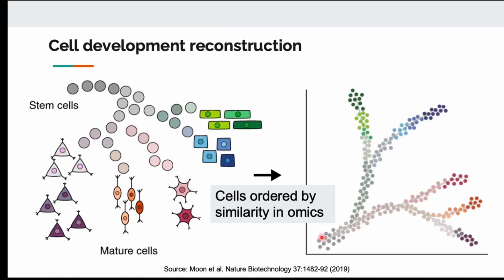So by isolating all the cells and collecting all the omics data, you are essentially seeing the transcriptomic program all the way from stem cell to differentiated cells. Inside your single cell data, you can imagine that you're getting transcriptomic signatures from different stages of cell development, mixed inside your tissue as individual data points.